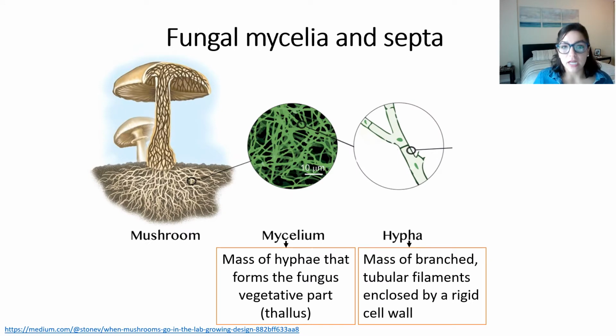When you prepare a slide to observe fungus, you will be able to observe different structures. And in fungus, we have different structural components. The basic one are the hypha, like this one, which is a mass of branched tubular filaments which are enclosed by a rigid cell wall.